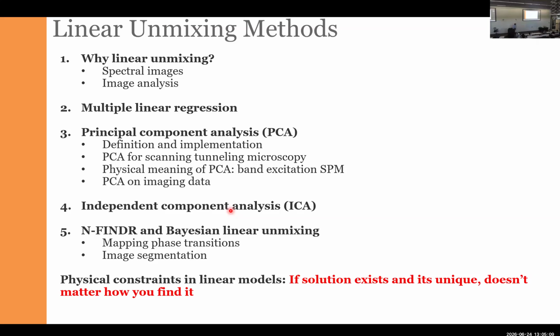So in these two lectures, one would be about the linear methods, another would be about the VAEs. We are going to try to focus on the philosophy of the data analysis and the hyperspectral imaging and look at several examples of the analysis techniques. So the first important thing is, why do we use linear methods?